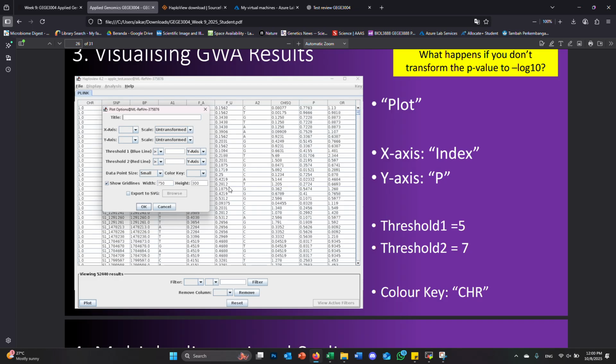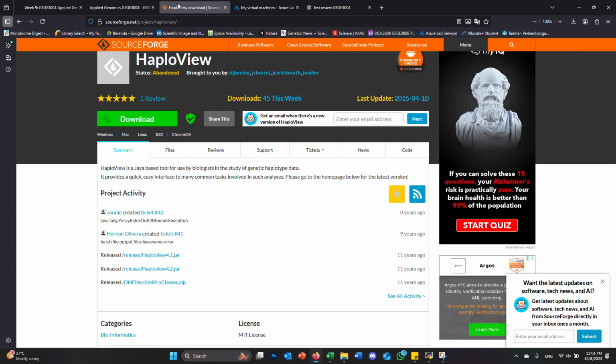Okay, so hopefully those windows are open. Once you do that, you should see numbers and headers appear in the middle of the HaploView page like you see here on the screen. From the lower left corner, you want to select Plot. You can see it on the left side of the screen here. Select Plot, and a new menu should appear. In that menu, you will see the screen as you can see now.